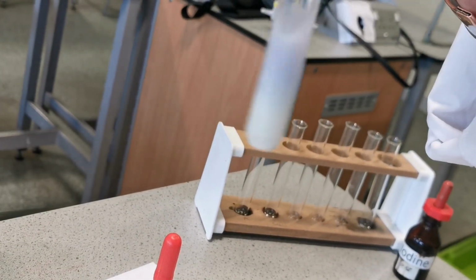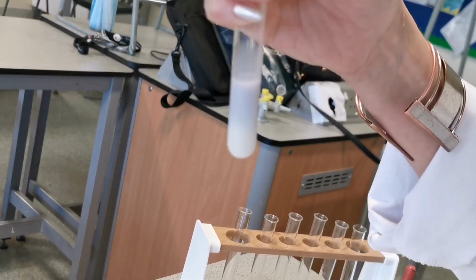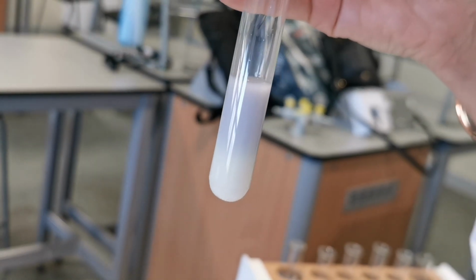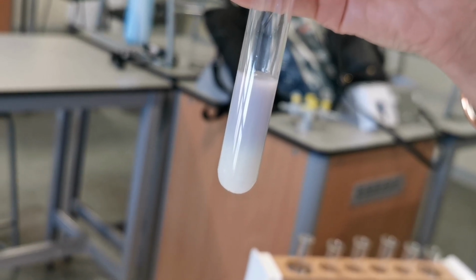I'm going to give that a little shake. Put my hand on the top. And there you go. We have a positive result there. So the test for protein is biuret, and it turns it a lilac purple colour. So let's write that one down.